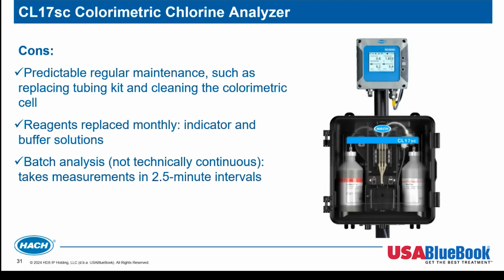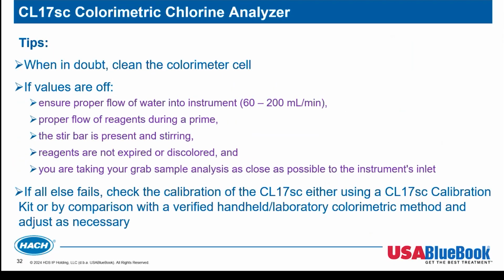This is also doing a batch analysis. We're doing continuous 2.5-minute intervals of readings. And so we're not technically getting a continuous measurement reading, but really for all intents and purposes, this is just exactly what we need. Go ahead, next slide.